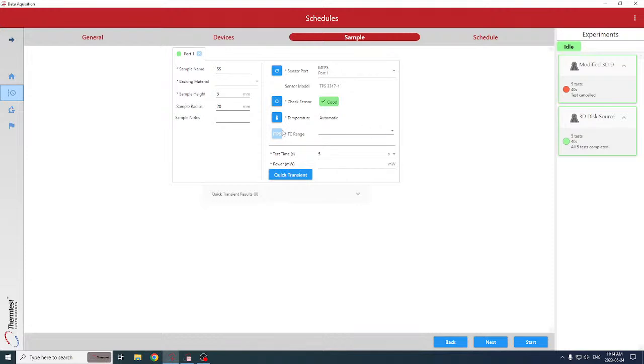Here is where we would run the ITPS, and what that does, it's a continuous measurement where the sensor is looking for the edge of the sample. Again, in slab mode, our semi-infinite body is in the in-plane direction. So it knows the radius of the sample, and it knows the diffusivity based off the measurement it would take. So it's looking at the time and diffusivity of the sample to identify a test time and suggest that to the user. That's about a 2-minute measurement.